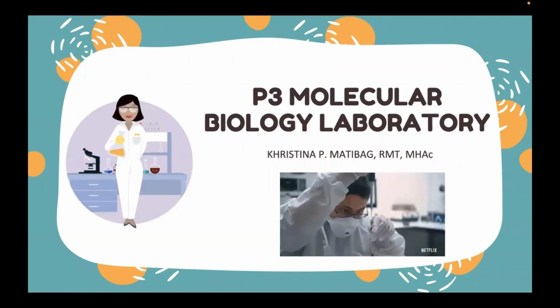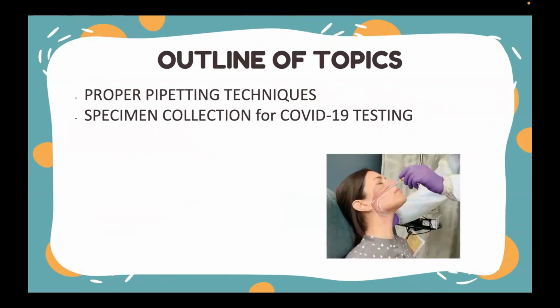So, the topics that will be covered in this discussion are the ones that are included in your laboratory examination this week. So, please pakiaral po yung mga step-by-step procedure and then yung mga definitions natin later on. So for the outline of the topics, number 1, yung proper pipetting techniques, the step-by-step procedure, the what to do and what not to do in doing your pipetting, also the specimen collection for COVID-19 testing. Lahat po yan included sa ating laboratory examination.